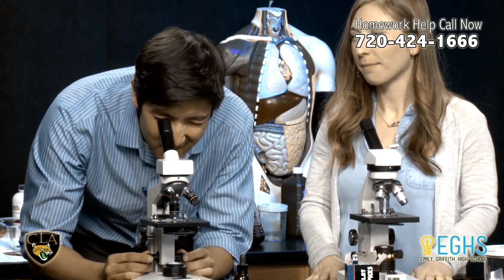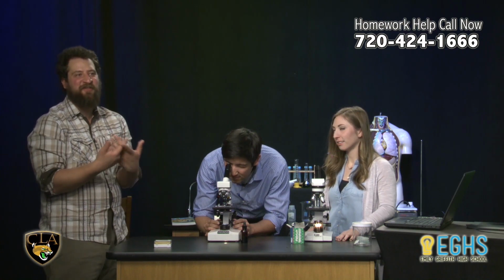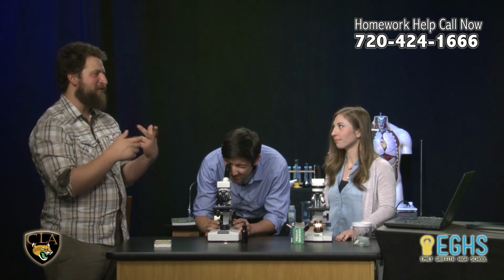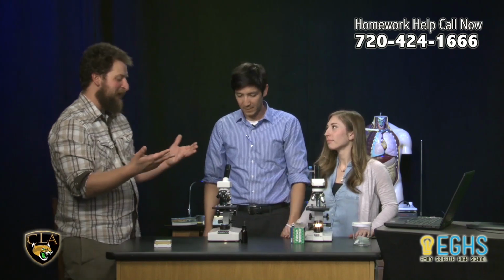Yeah, and it's sort of tricky getting the feel for using a microscope. It's a little awkward at first, but it really is something that if you practice it a little bit, it starts to feel more natural. I have taken to just looking at lots of things under the microscope, and sometimes it's a total failure, like the microscope doesn't reveal much. Other times it's cool, and I'm getting better at using it.